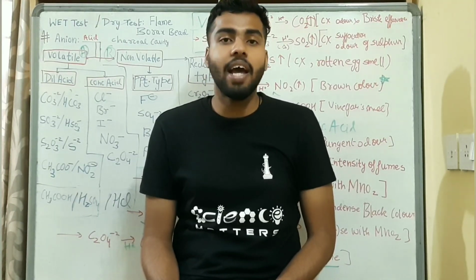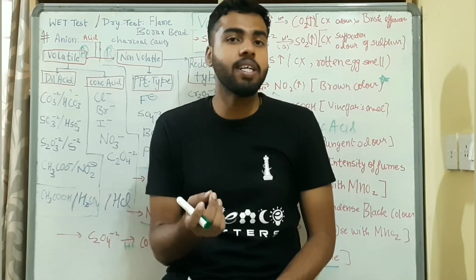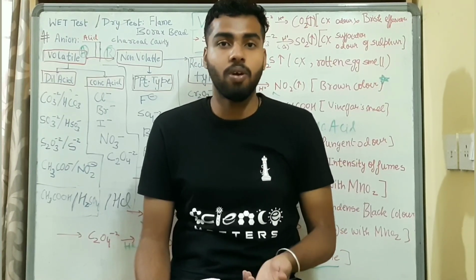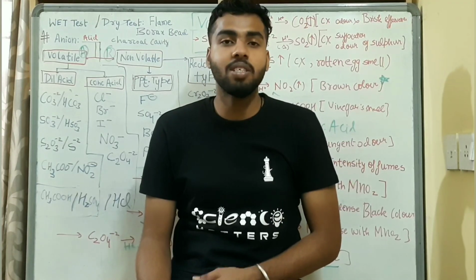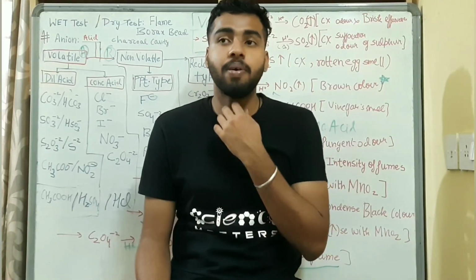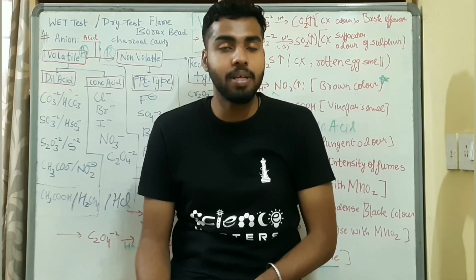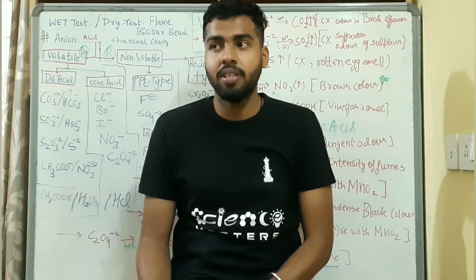Salt analysis is a technique to find which salt is provided to you. Like in the examination, if I'm a teacher, I'll give you some salt and I'll ask you to find the composition and the type of salt, like if it's NaCl, BaCl, what salt it is. As of now, there's no specific scheme for how to do it, but there have been some tries from scientists to make a scheduled way to find out the acid radicals and the basic radicals.